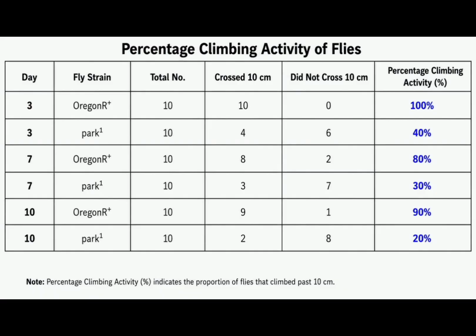One thing has to be noted here that this is one set of our experimental data. You can perform this experiment in multiple sets to obtain statistically significant result.